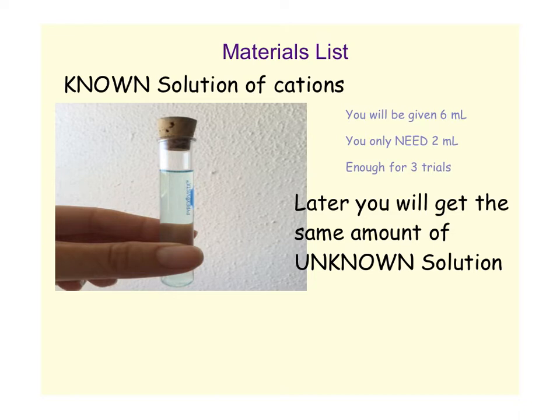However, if you need more solution, you use all 3 of those, it is going to cost you some points to get some more solution at the end of it. So make sure you don't do this entire experiment with all 6 mL.